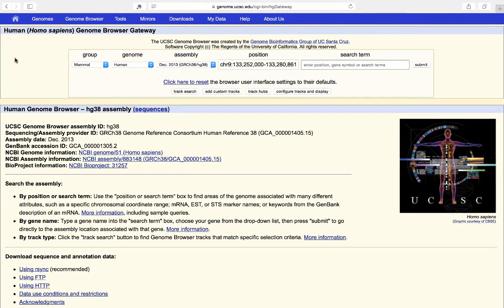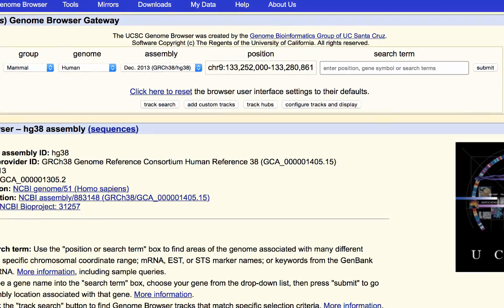Clicking Genome Browser doesn't take us directly to the browser — instead it takes us to a page called the Gateway. The Gateway allows us to select which assembly we'd like to view using drop-down menus for Group, Genome, and Assembly. There's also a Position box showing what position we'll be viewing, and a very powerful Search box that we can search on a variety of terms, which I'll discuss more later.